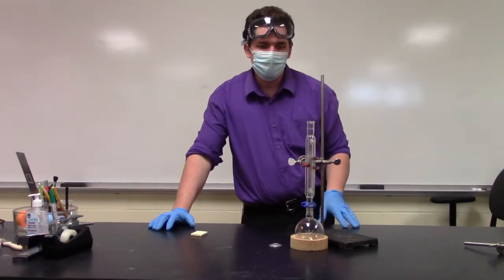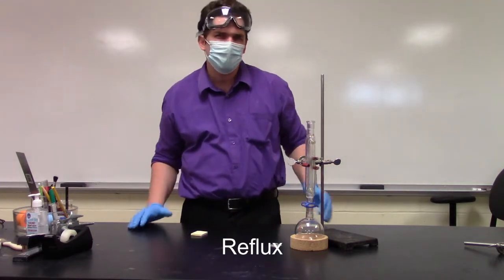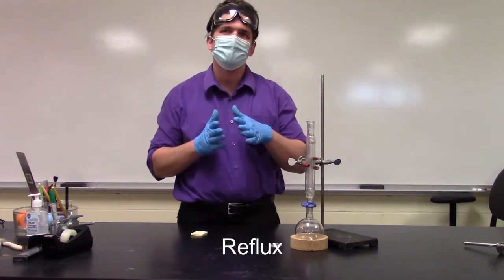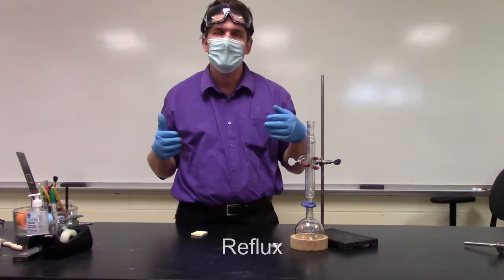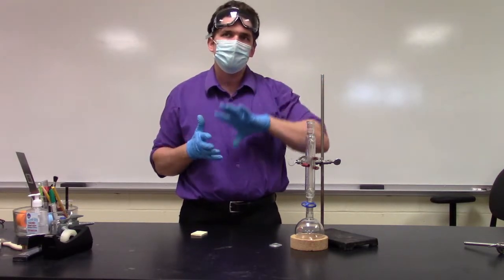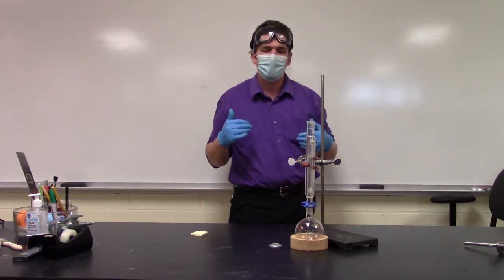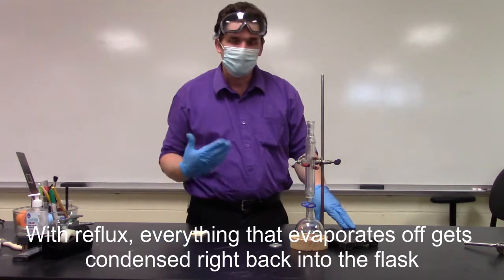So a concept related to distillation is reflux. Now, refluxing we can think of as kind of a special case of distillation. With distillation we typically are trying to separate two different compounds, and one's going to come off the top of the distillation column, the other is going to stay in the distillation flask. Well, in this case we kind of want everything to go back down into the distillation flask.